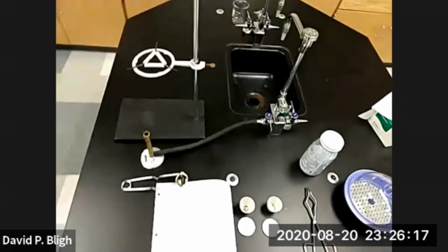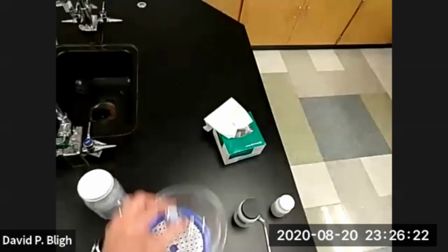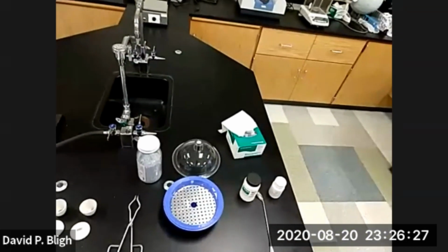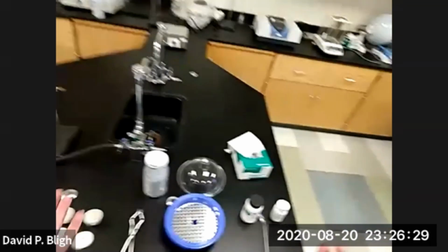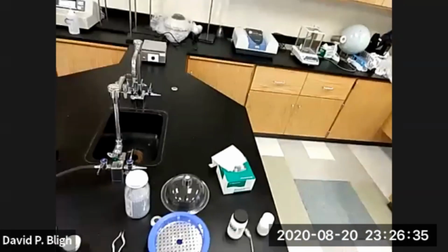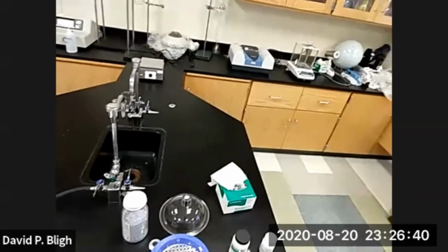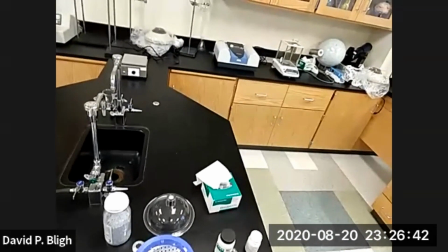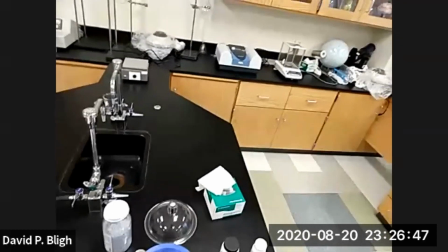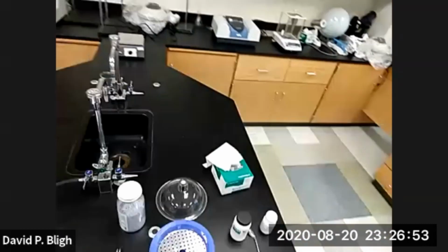All right. So first thing we need to do is set up our desiccator. This is a desiccator. A desiccator is a device into which you put something, and you want the atmosphere to be completely devoid of water. And in our case, we're going to put something in that desiccator that has been heated. We want it to cool down in such a way that it does not reabsorb water. So we cool it down inside the desiccator where the relative humidity is 0.